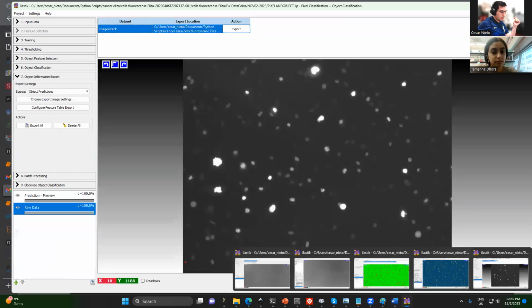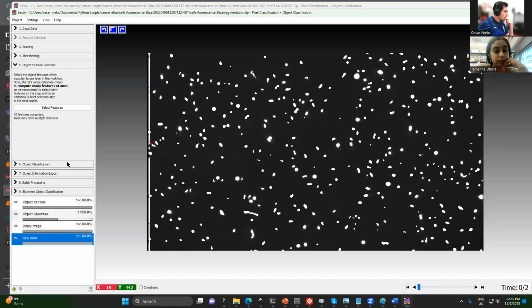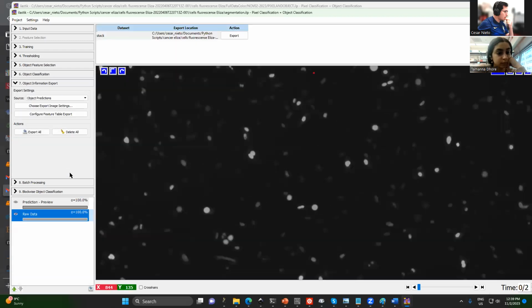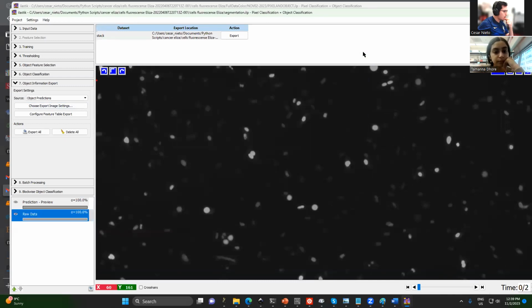And I exported here the predictions in an H5 file, but this should also have the segmentation.